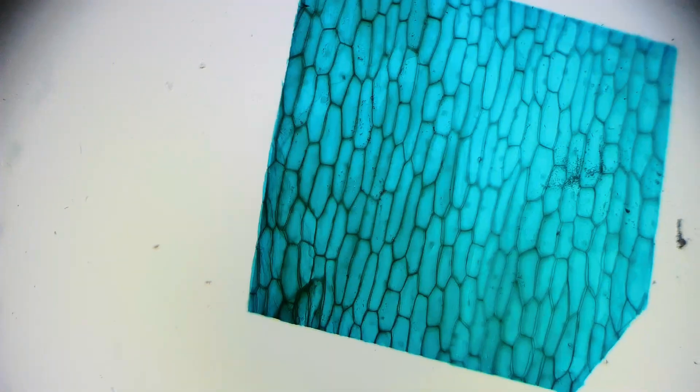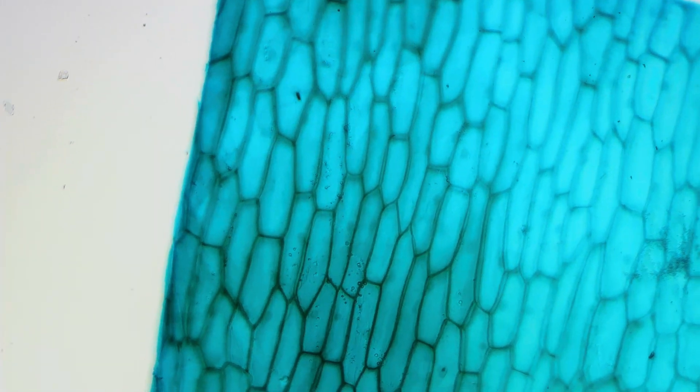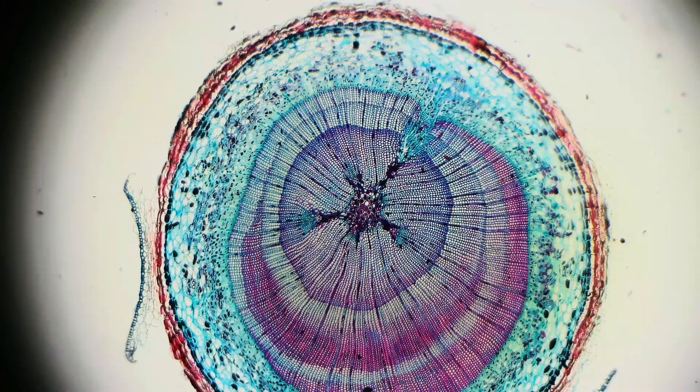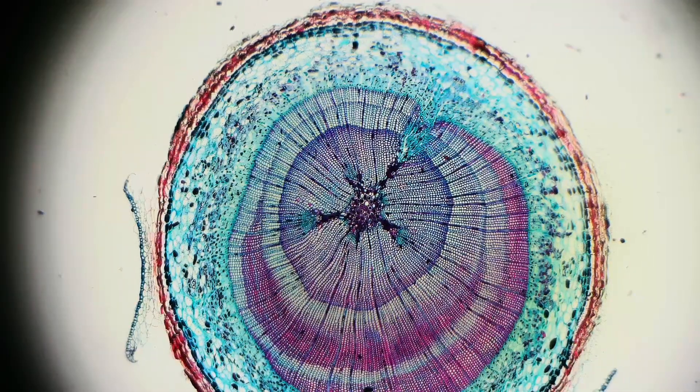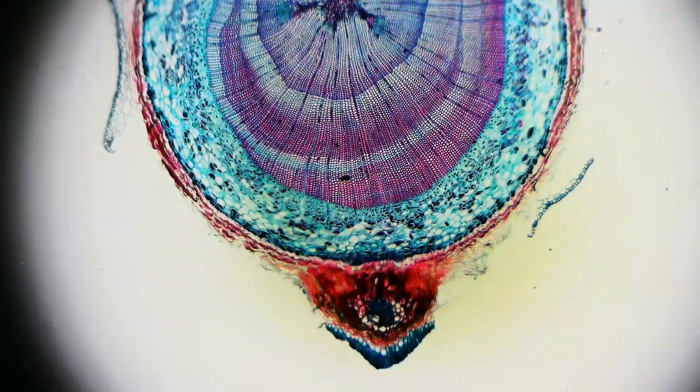After testing a variety of samples, I'm really impressed with the performance of this microscope. Whether it's biological samples, electronics, coins, or just everyday objects, the microscope consistently delivers high-quality images with plenty of detail. So whether you're a student, hobbyist, or professional, this microscope has the versatility and power to meet a wide range of needs.